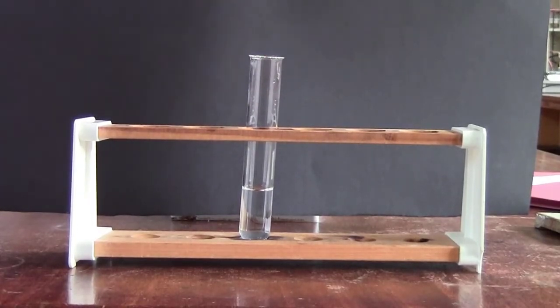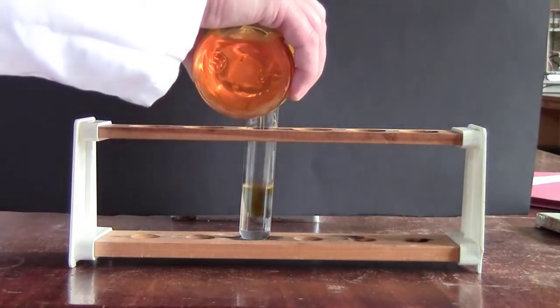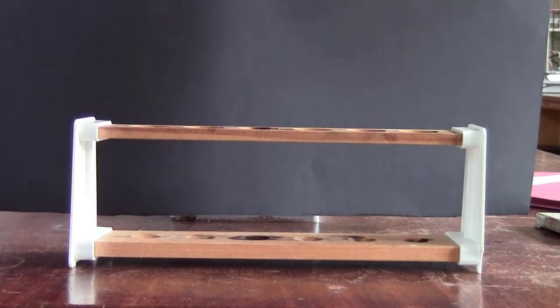This is a solution of sodium iodide. Again, it's a colourless solution. This time we're going to look at the reaction with bromine. If we add some bromine water to it, we can see that it goes a bit of a reddish colour.